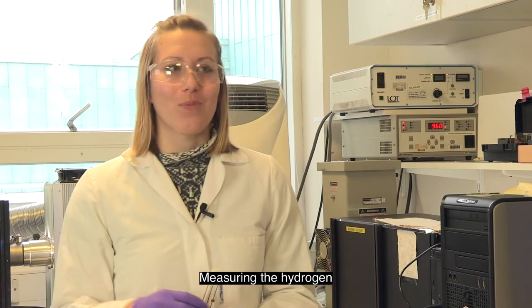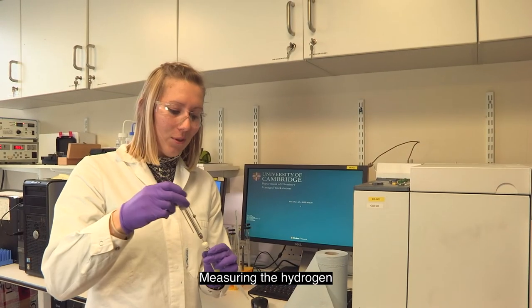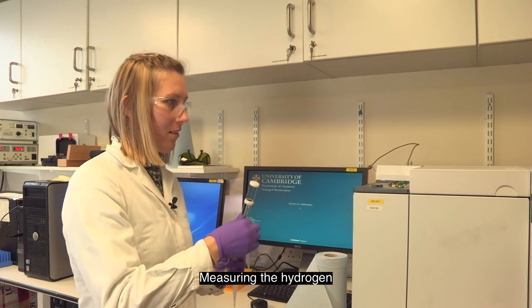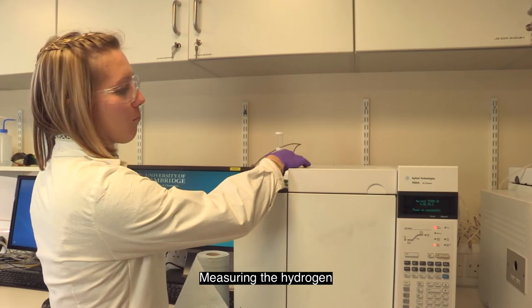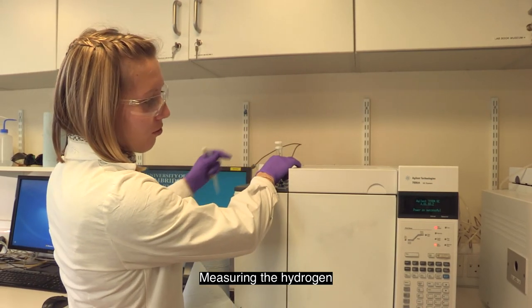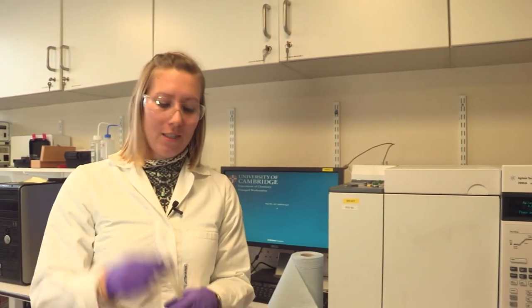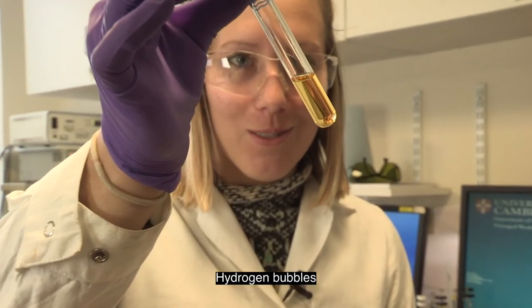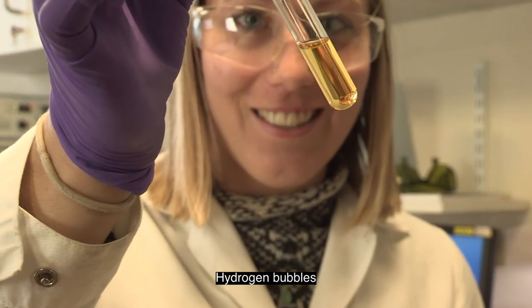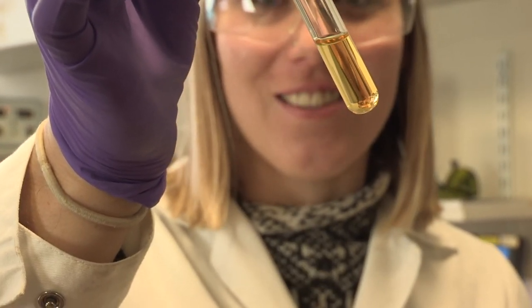To do that, I use this fancy machine over here. I take some of my sample and just inject it straight in. After a few minutes, it tells us exactly how much hydrogen is in this vial. When I shake this, you should be able to see tiny bubbles in the vial — and that's actually the hydrogen bubbles that you can see there.